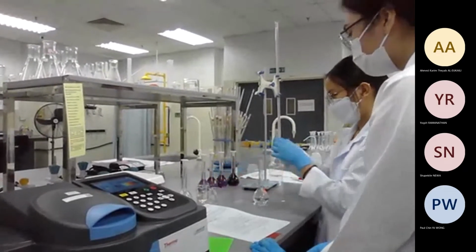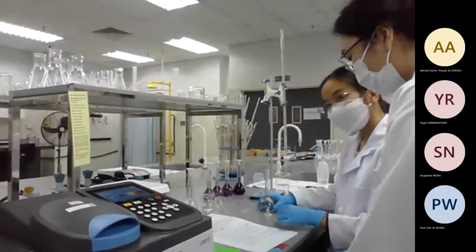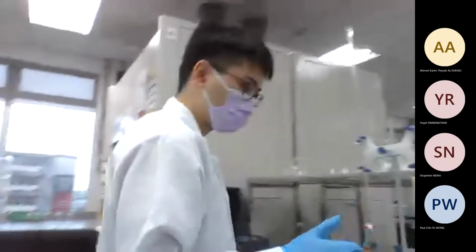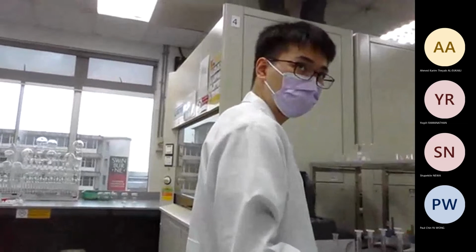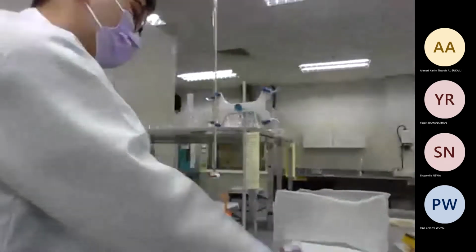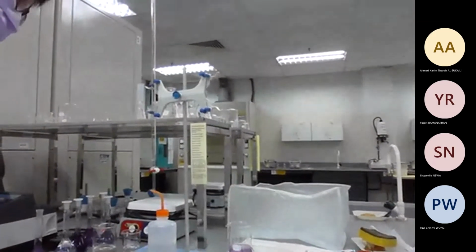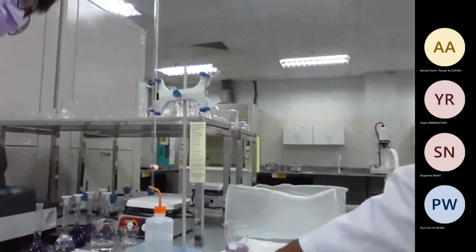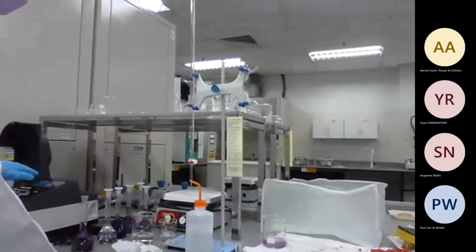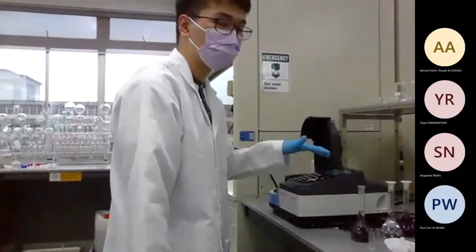This is the blank? Oh, for the blank, Francis, did you put water or the blank one? The blank. Oh, good. I think I told water, right? So sorry, that was my mistake. Yeah, you take the blank first, then solution 2, 3, 4, 5, like this, right? Where will they show the result for this? Which one, I think here, right?